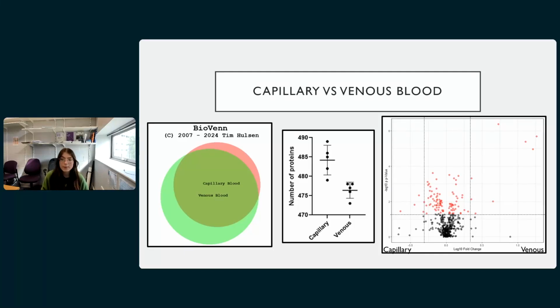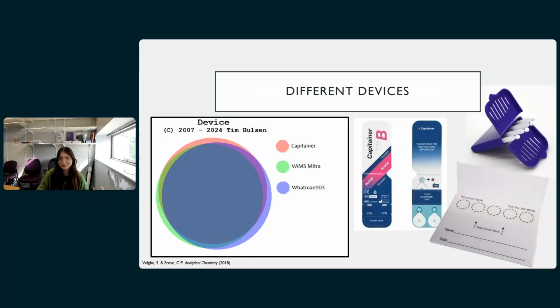Now, they were minimal for the capillary, but if you're anything like me or my supervisor, you are looking straight at those 4 proteins in the top right-hand corner. They're fibrinogens and 1 coagulation factor, completely expected and consequential for the difference between venous blood and capillary blood. I've not, sadly, magically found a wonderful protein biomarker.